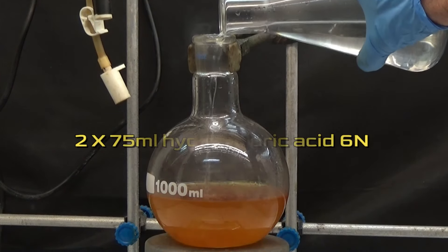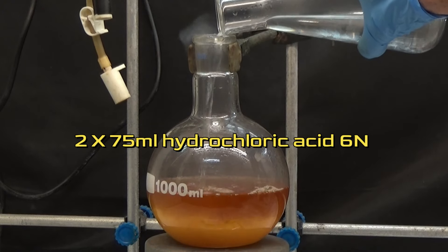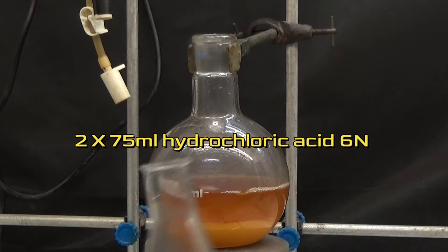To extract aminonitrile from toluene, we will use dilute hydrochloric acid to form amine hydrochloride, which is soluble in water.